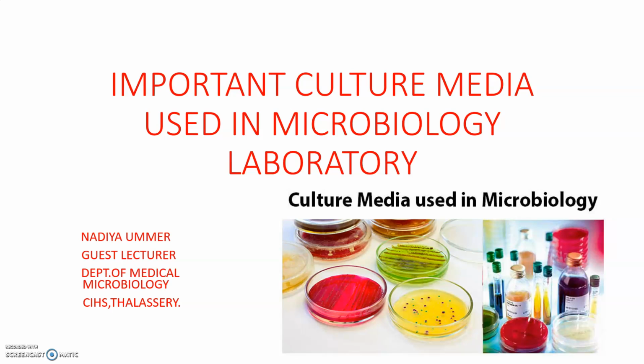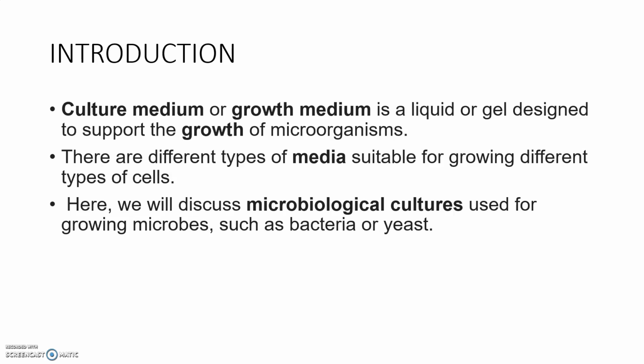So today we are going to discuss important culture media used in the microbiology laboratory. The culture media, or growth medium, is a liquid or gel which is designed to support the growth of microorganisms.